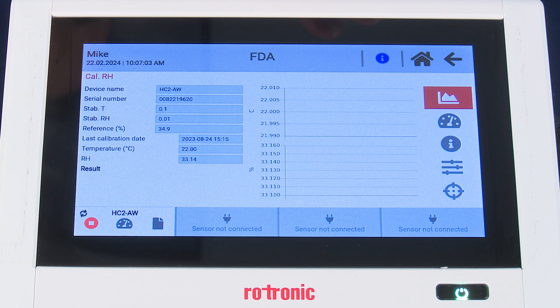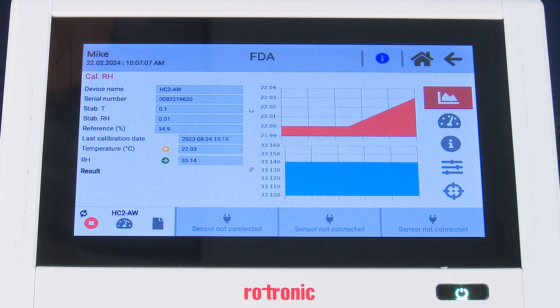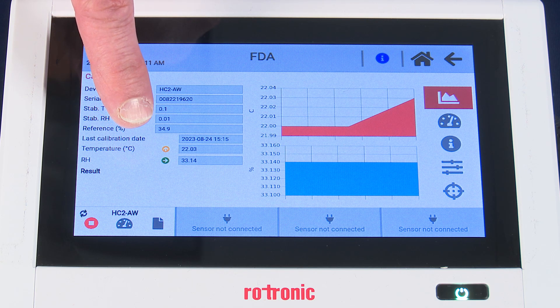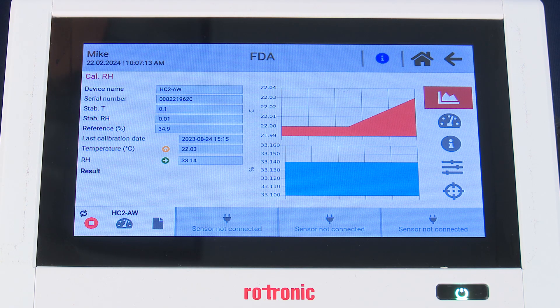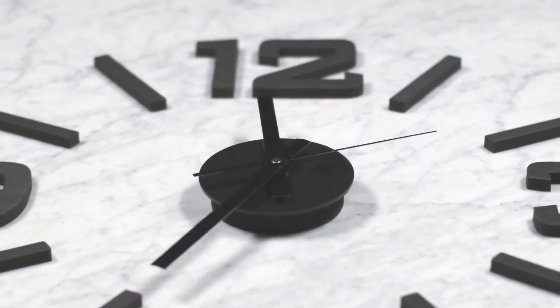You can see that we are in measurement mode by the spinning arrows. We also have trend indicator bars pointing yellow vertical, green horizontal, and yellow downward, indicating that the unit is looking to reach equilibrium — or humidity and temperature stability. This process, depending on the humidity standard, can take anywhere from 30 to 60 minutes to reach equilibrium.